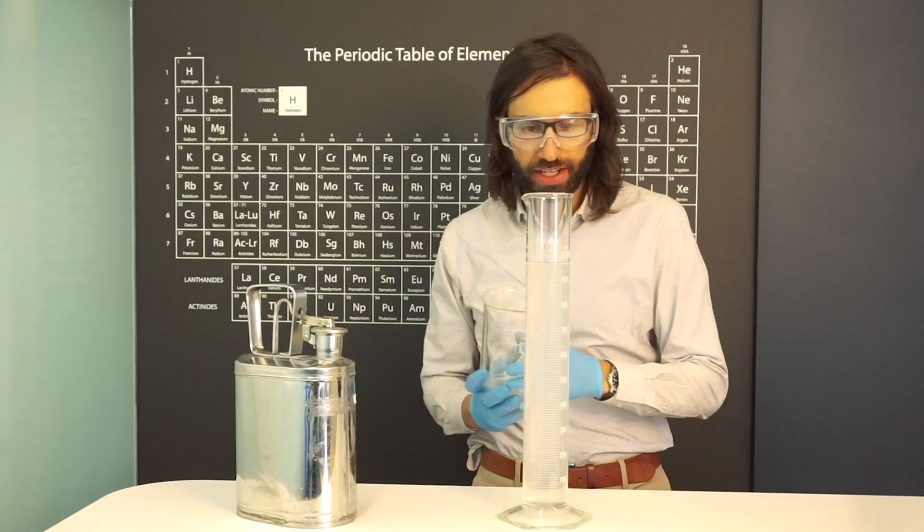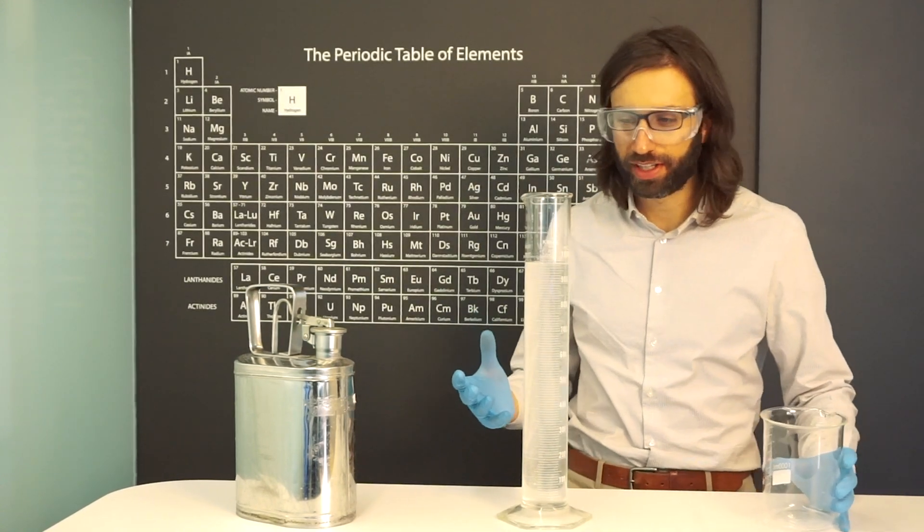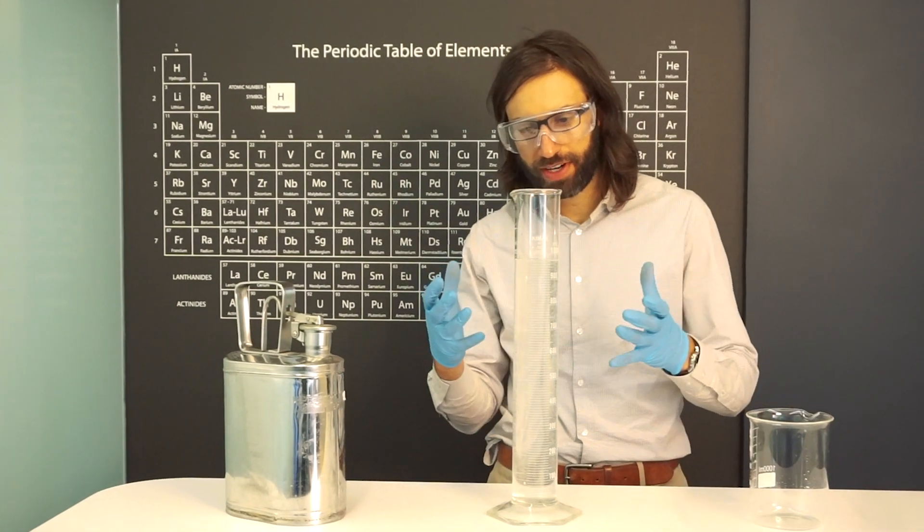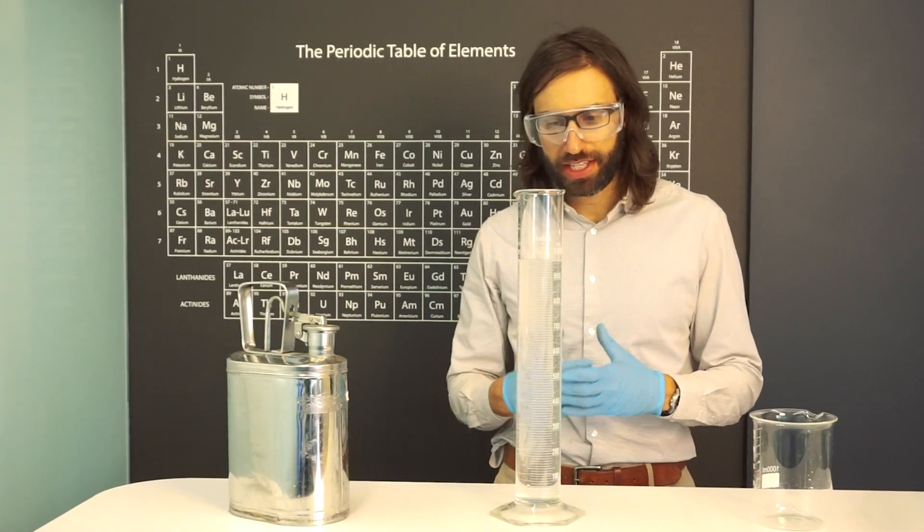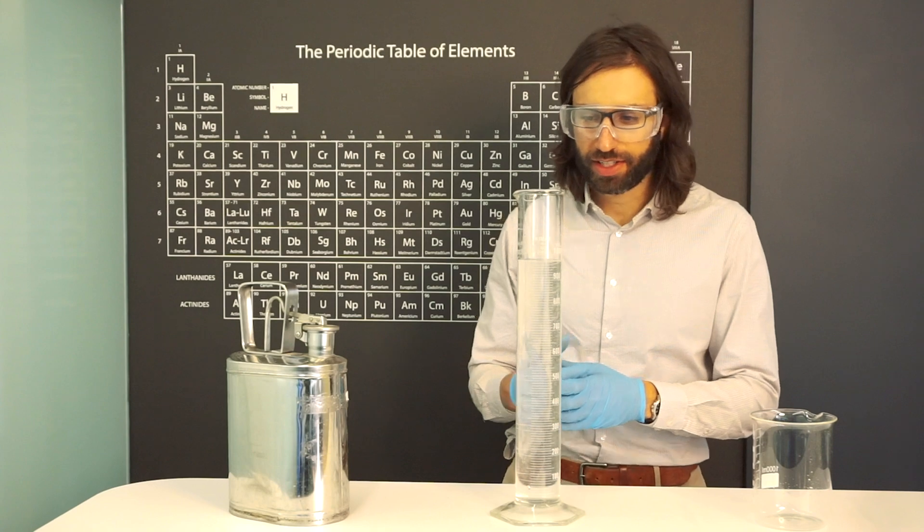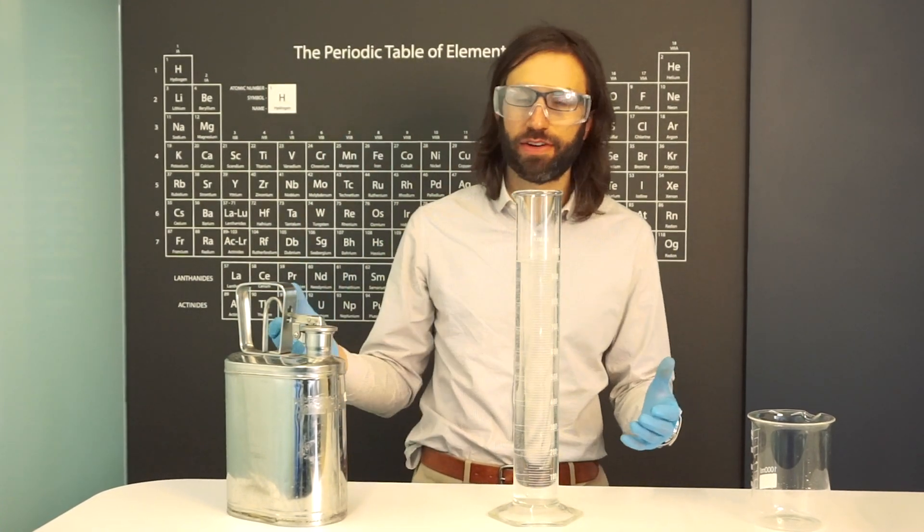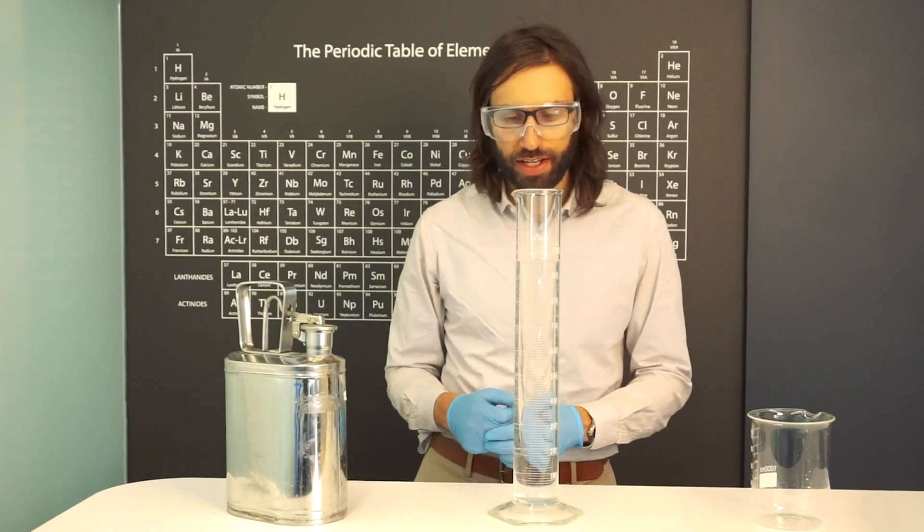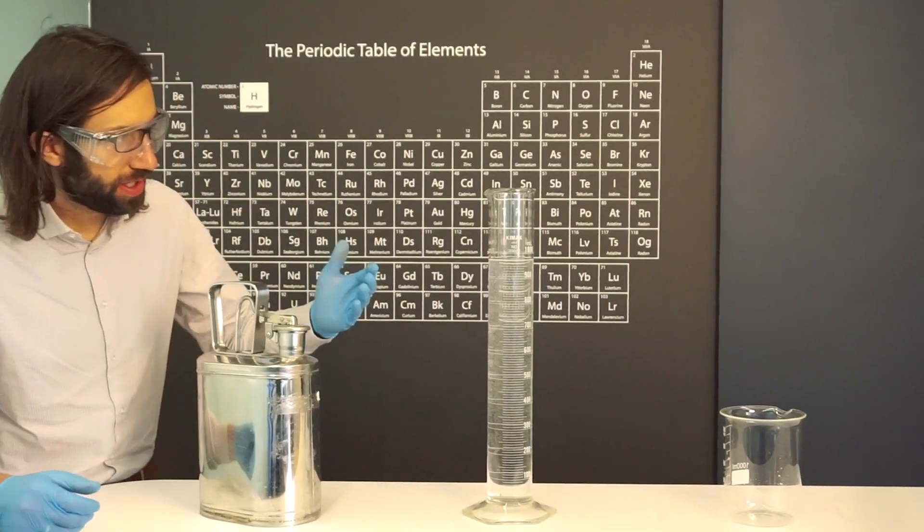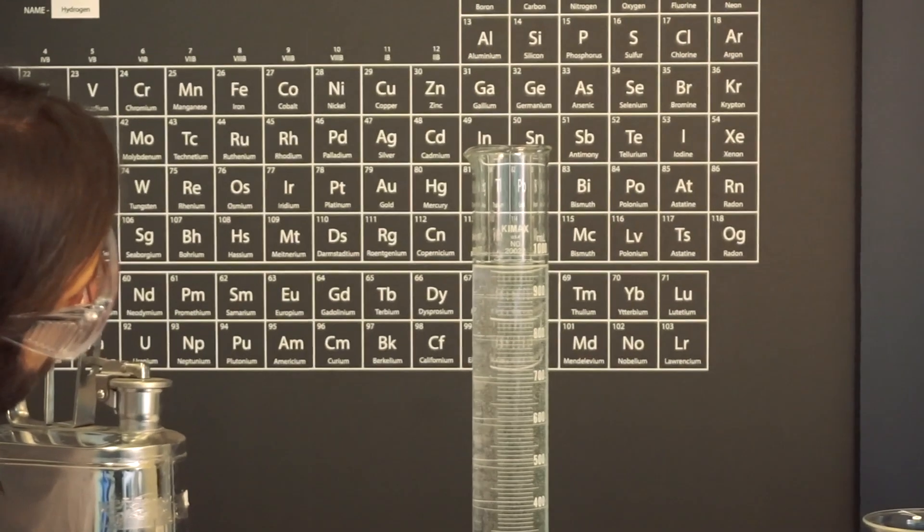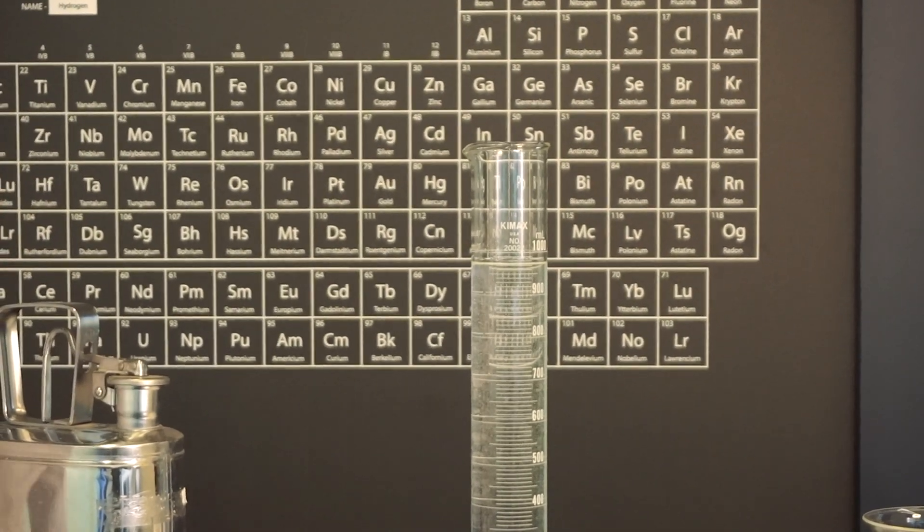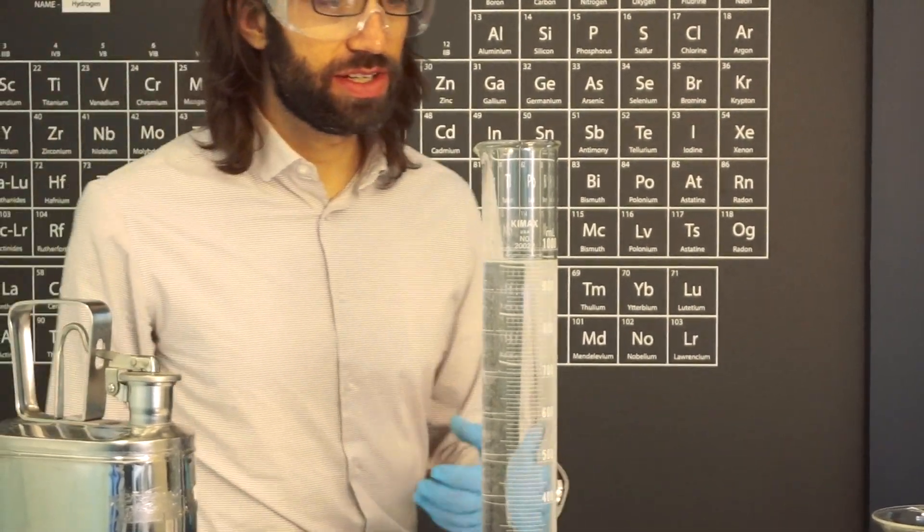But here's the crazy thing. It's not that exciting mixing two clear liquids, but what is very interesting is that the total volume is clearly less than a thousand milliliters, one liter. We have 500 milliliters of water, 500 milliliters of ethanol, and we ended up with 970 milliliters of solution total.